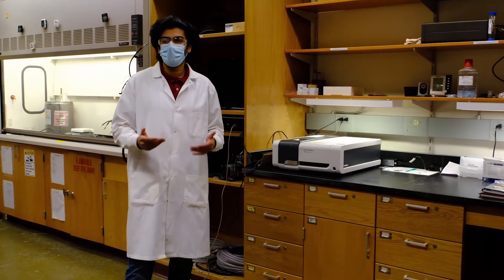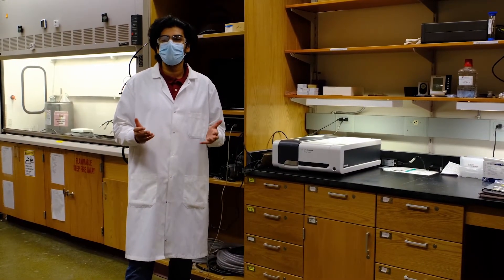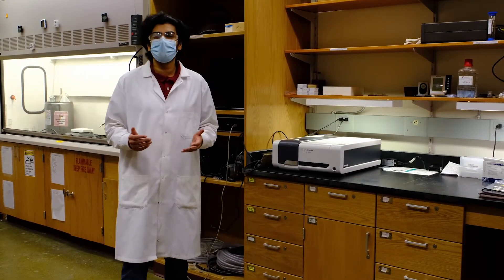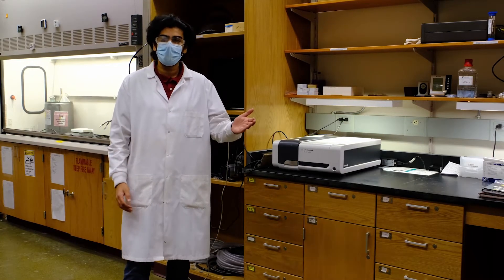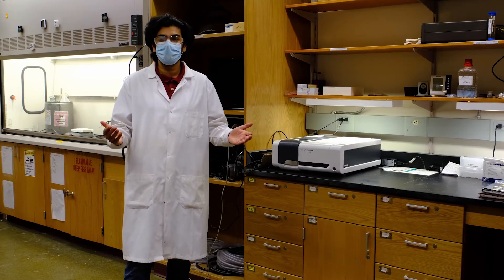This apparatus is a UV vis spectrometer and is one of the most commonly used machines in our lab as it determines the absorption spectra of solution and film samples from the ultraviolet to the visible wavelength regions of the spectrum.